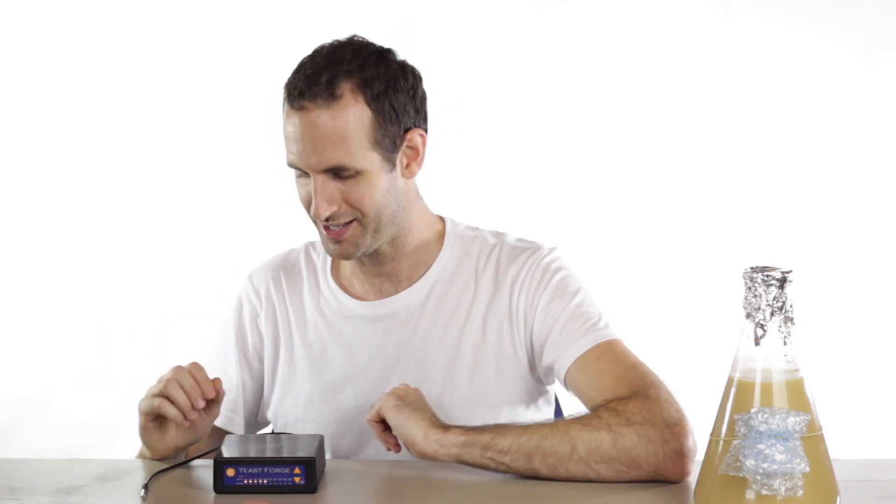It's very easy to use and I hope you like it. So this is the Yeast Forge. If you have any comments or suggestions, please leave them under this video because your suggestions help shape the products we build in the future and how we develop our existing products as well.